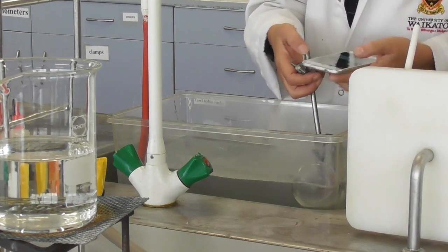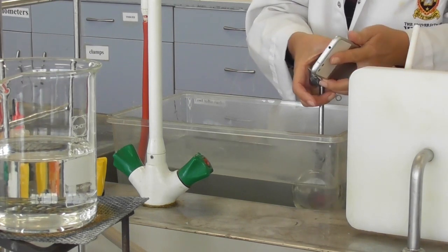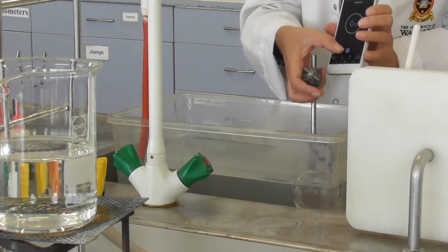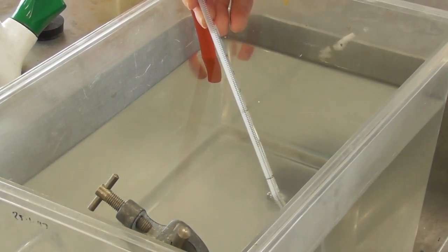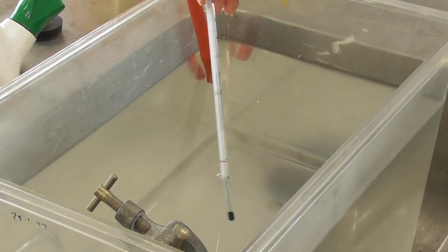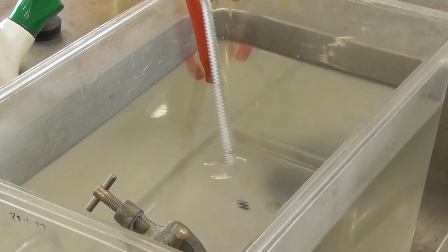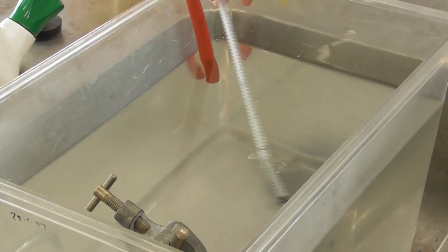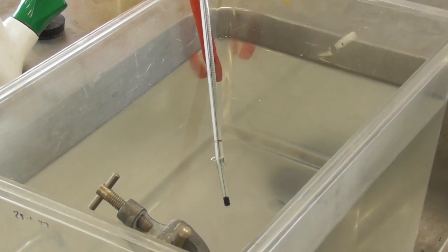We start our timer again. It's another five minutes for the flask to be in the cold water so that the temperature again can adjust to the temperature of the water bath. We can take a reading of the temperature for the water bath and write this down on our sheet as well.